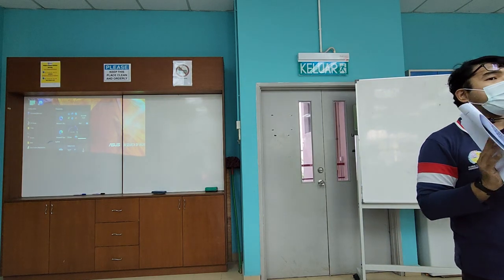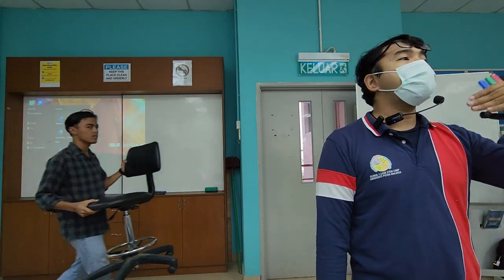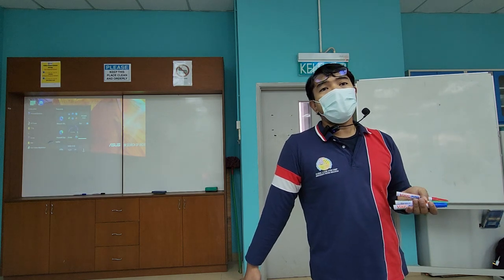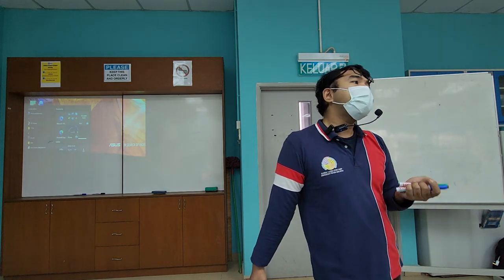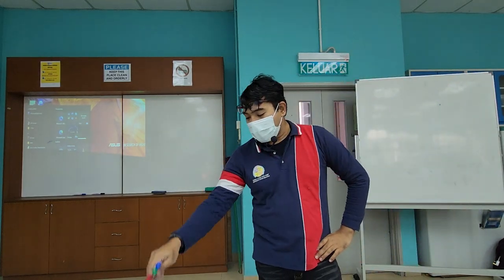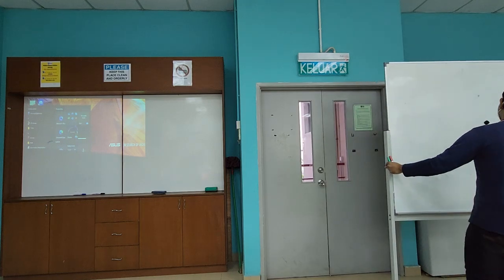So when you're done with this, we will quickly do the second activity, which is germinating some seeds. Seeds, I think, should be corn seeds. This experiment is not meant to be for today, but it is for the coming weeks. You need to wait for the seedlings to grow so that you can do the progressive growth analysis. Remember the formula that you saw on Monday. It requires T1, T2, initial time and final time. That means it is a progressive data that you need to take. Okay? So we're going to germinate earlier so that if anything goes wrong somehow, we still got time to make amends. Right. So let's start with leaf area.